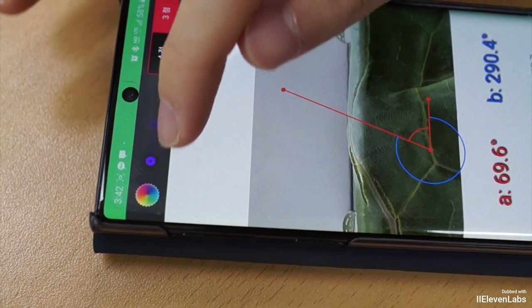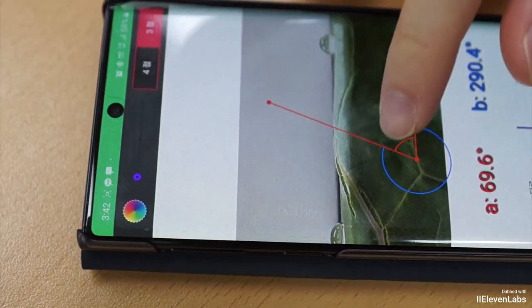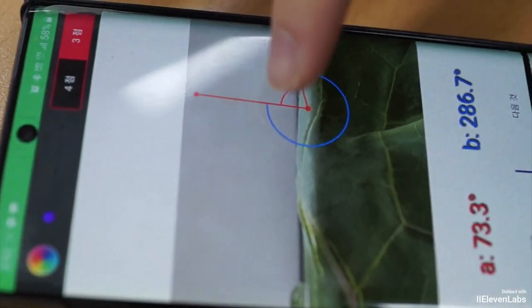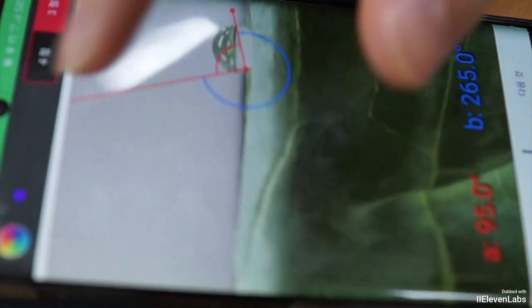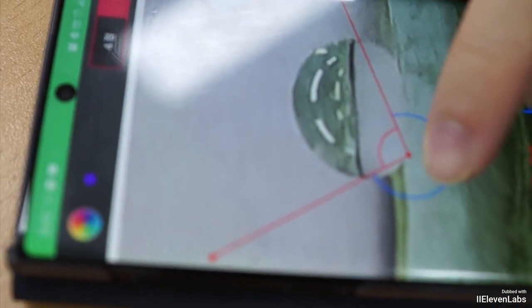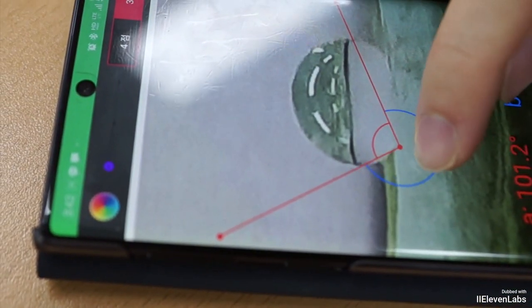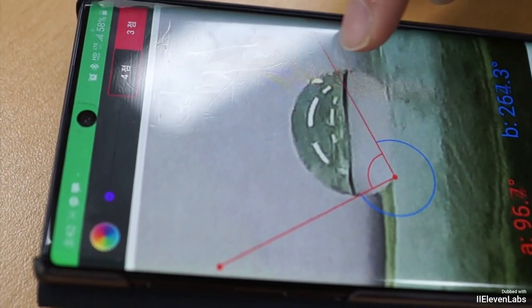This shows a student measuring the contact angle using their smartphone. As you can see, the contact angle can be easily measured with a simple tap of a finger, making it an easy way to observe the presence of wax on plant surfaces and conduct experiments on the role of surfactants. This makes for a straightforward and practical teaching tool.